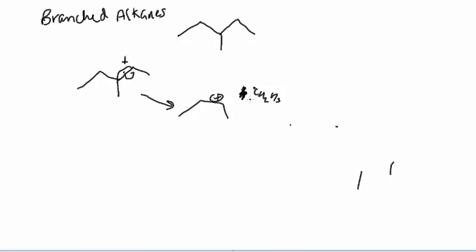All right, now that is the better result than the following alternative, namely this. Suppose that we ionize this CC bond here, this bond. Let's write the result of that.